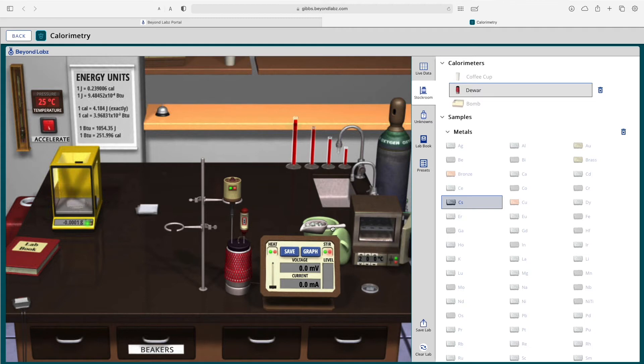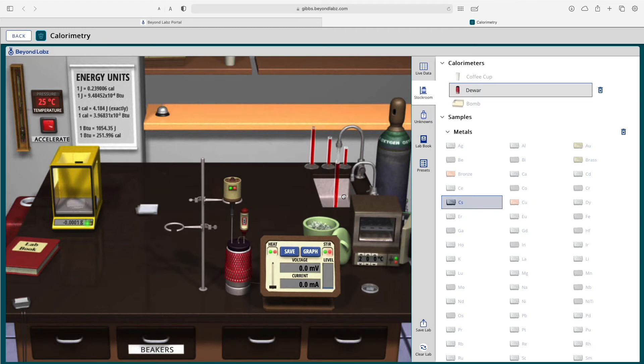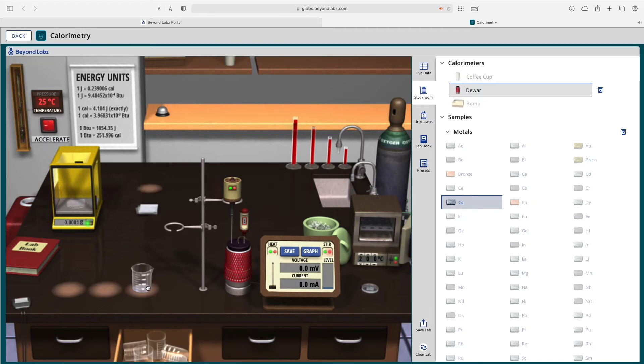There's ice that you can add to your calorimeter. You can get water from the sink as well as get beakers from the drawer.